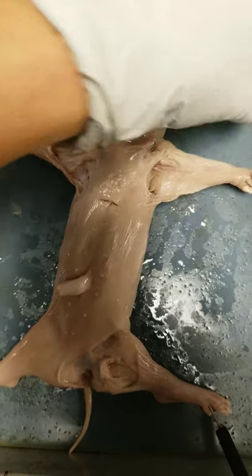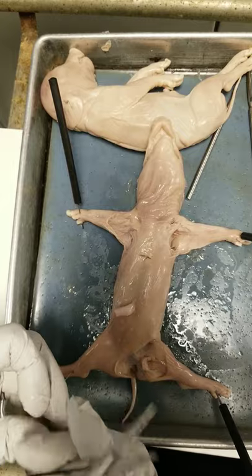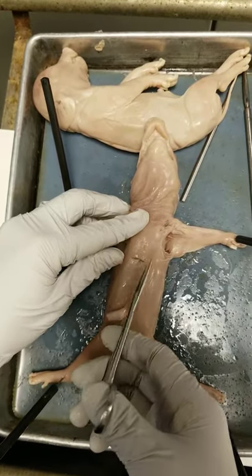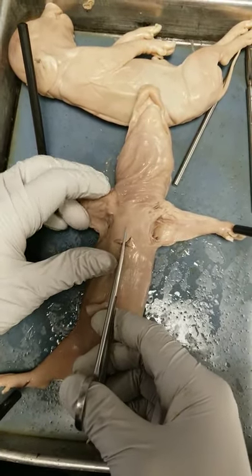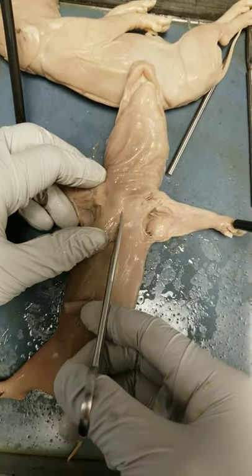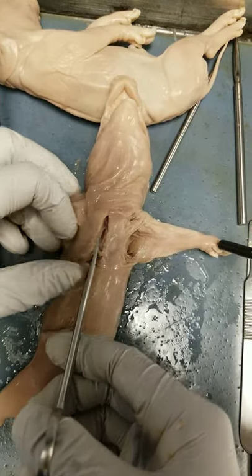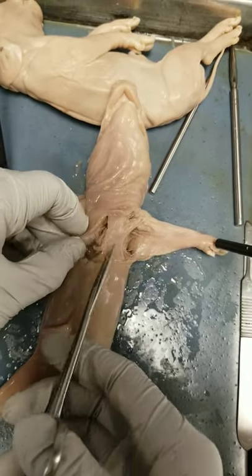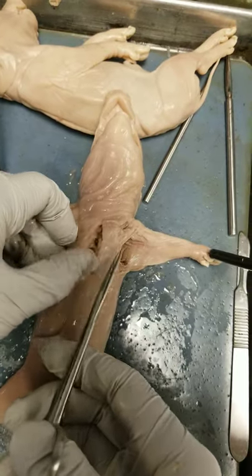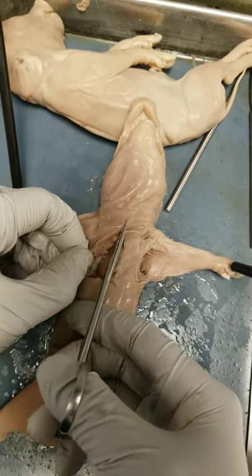I'm going to take my scissors and cut into the thoracic cavity, cutting through the sternum. It's pretty simple since the bone isn't fully developed — it's pretty weak and also tiny. I'm trying my best not to damage the organs underneath because we want to see them more clearly.